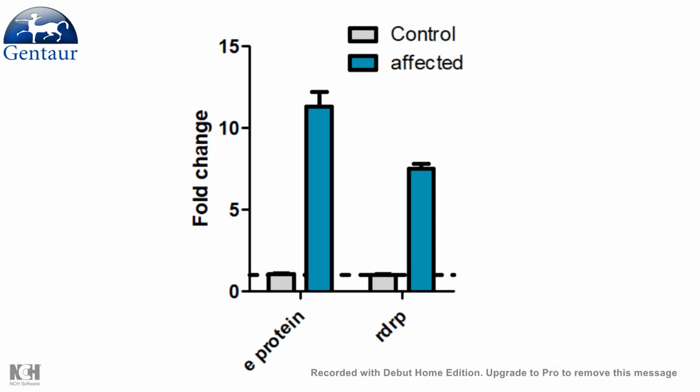At the end of the day, the clinician would check for the fold enrichment of these viral mRNAs in your blood sample or in your sputum sample. And if they see a significant amount of enrichment, that means that you are affected.